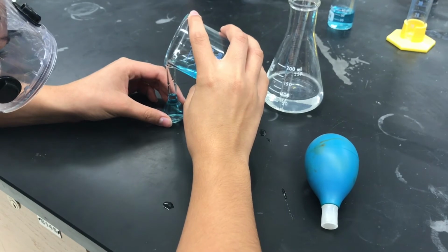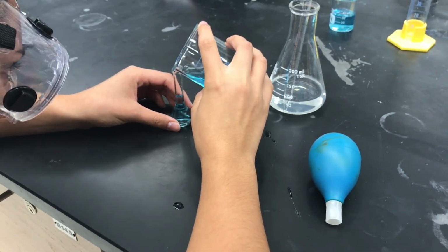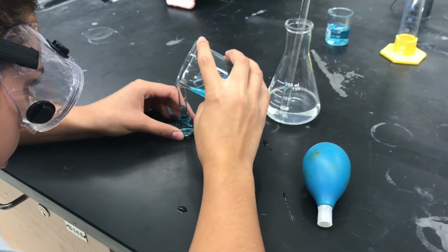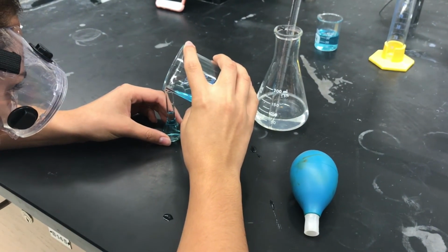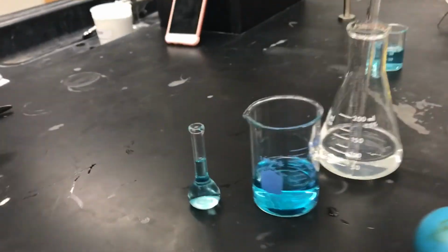And lastly, don't forget to clean up your workplace. Dispose of solutions and dilutions down the drain. And then clean all glassware, dry it, and put it away. Clean up your workplace using a paper towel, and then you are finished.